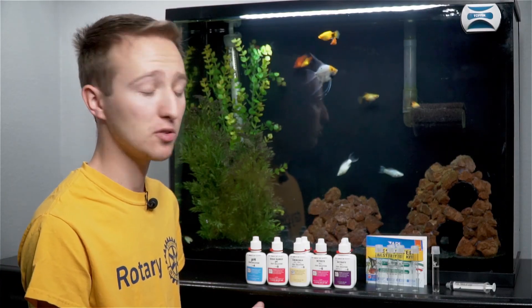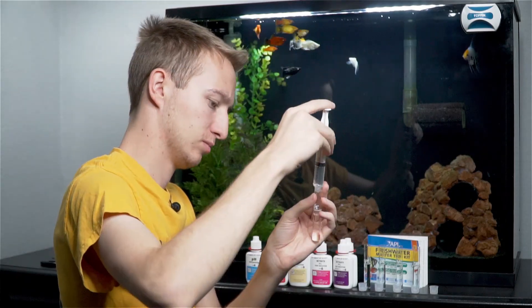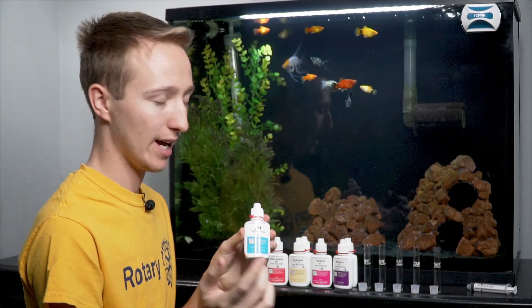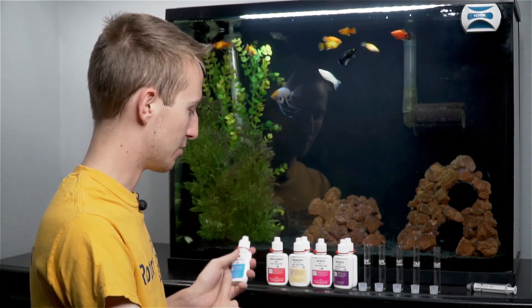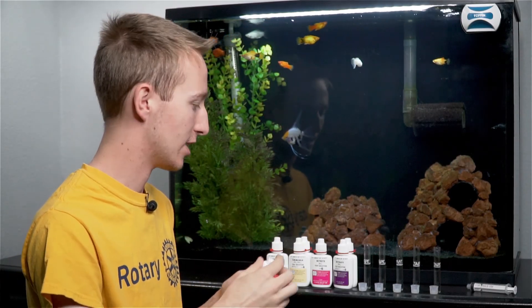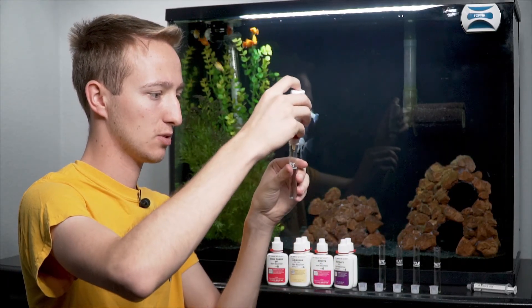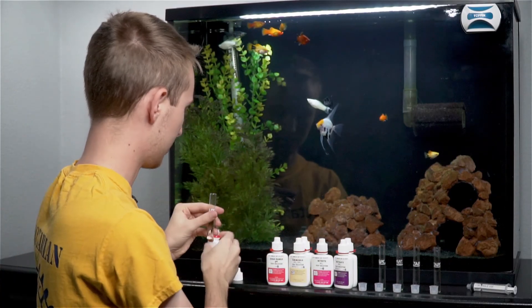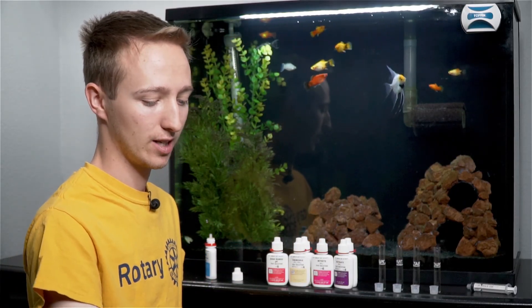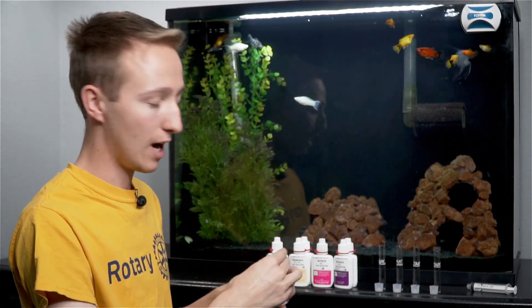The very first thing I'm going to do is uncap all of the bottles and fill each test tube with five milliliters of water. One nice thing API did is add a little water drop icon on each bottle showing the number of drops you're supposed to add. The pH and high range pH are pretty much instant tests and you don't need to vigorously shake them, just a little inversion. For the first one, I'm going to give it a little shake, and it says to add three drops. I grab my first test tube, flip the bottle upside down, and add three drops — one, two, three. Then I cap it and invert it a couple of times.